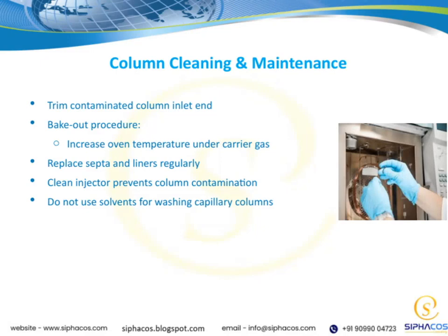Now, let's move on to column cleaning and maintenance, which is crucial for ensuring reliable and consistent results.